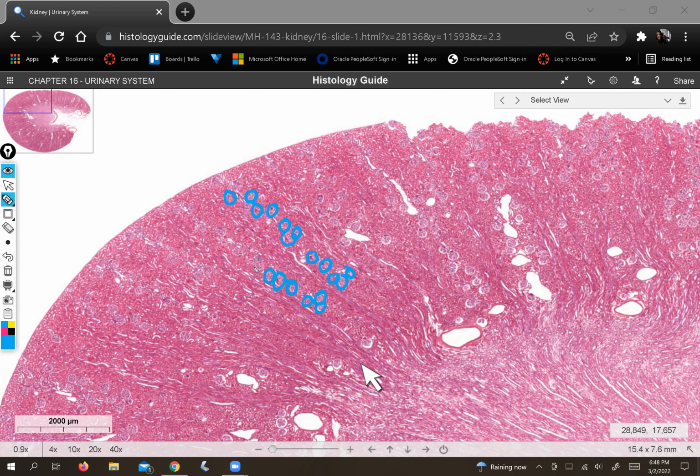They're linear, and they're pointing ray-like as well down into the medulla. So this is something that you would only be able to notice if you were zoomed out and had enough context to see it. I'm pointing it out because this helps conceptually connect the blood path through the kidney.